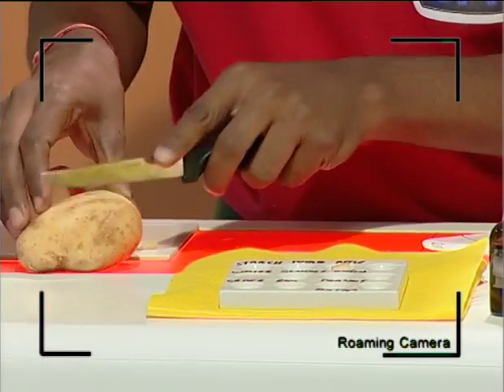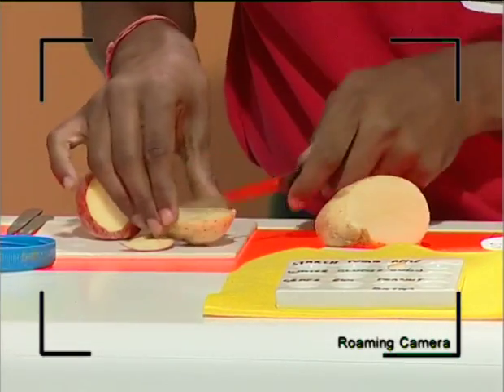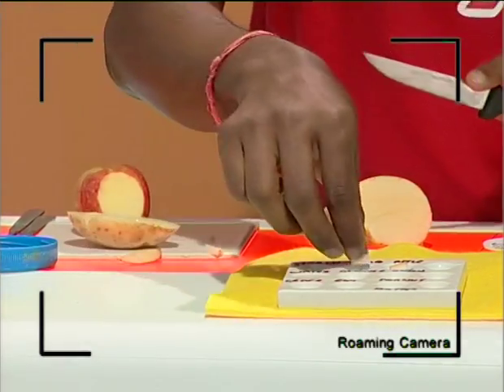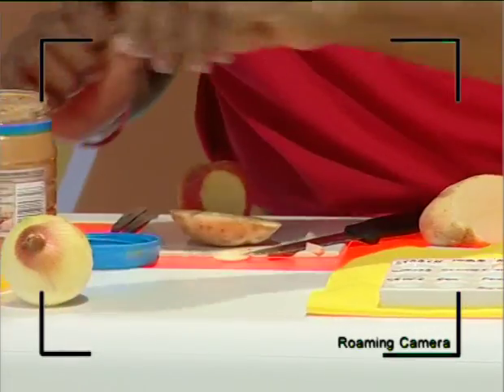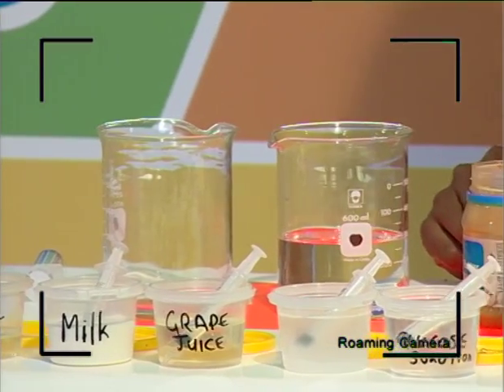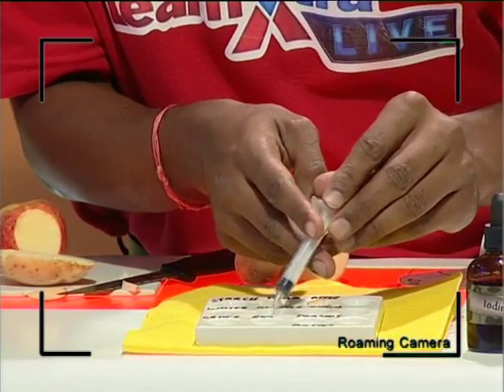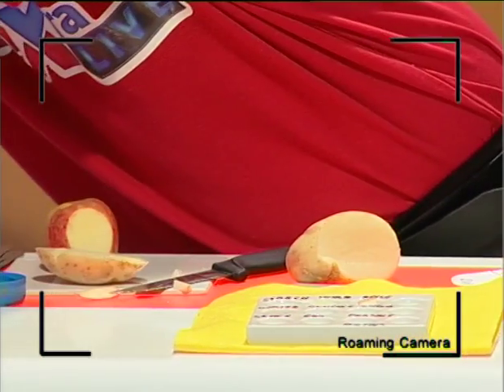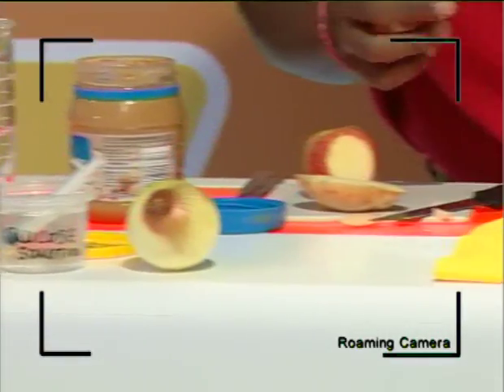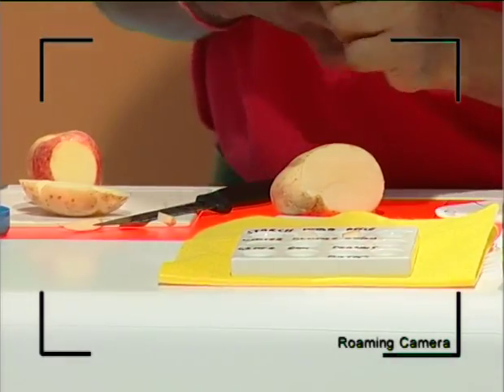We've also got to cut a piece of potato, so I'm going to cut the entire one, guys, and take a small piece and put it in there. You don't need a big chunk, just a small chunk. We've got glucose, which we need to test. Okay, grape juice, starch, glucose solution, there it is right here. Getting myself confused now. That's the glucose in there, and we've got a bit of egg. We need to test the presence of starch in eggs, guys. You can try various samples, guys. The more you try, the better your understanding of the subject will be. You can try this at home. You can easily get iodine at a pharmacy and try it out.